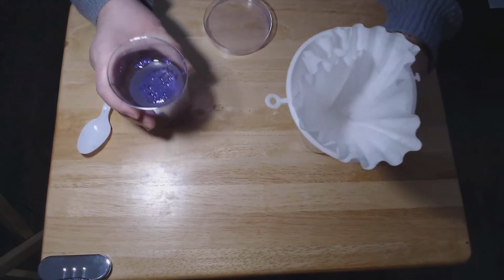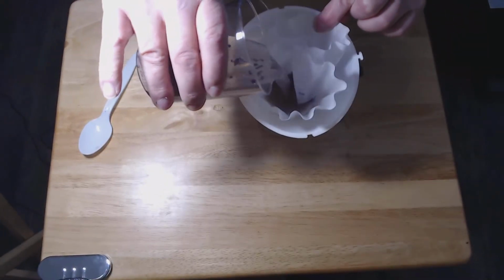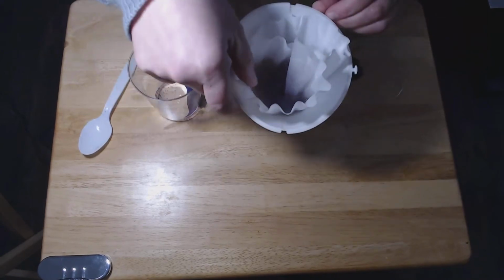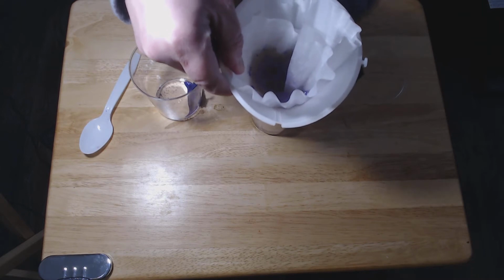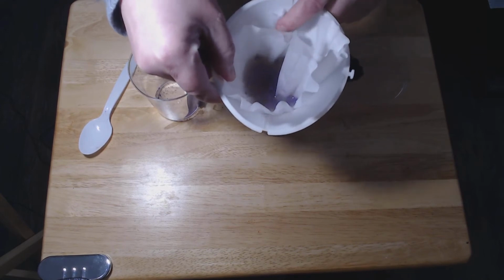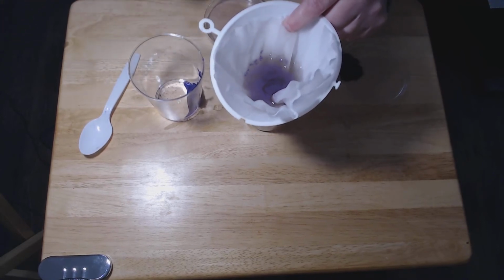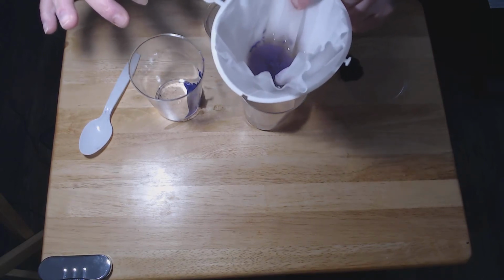In order to separate out the sand and the salt, I'm going to pour it through this funnel. What happens now is that the water is going to funnel out. It's going to take a minute. And as the water funnels out, it's going to leave all of the sand in the top coffee filter. So we'll let it funnel a little bit longer.